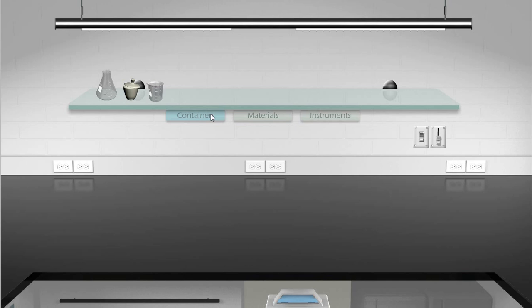To begin this experiment, we will pull two 50 milliliter glass beakers from the shelf and place them on the workbench. The reason we are using glass beakers is to hold our solutions of sodium hydroxide and nickel 2 chloride. This is beaker 1, and this is beaker 2.